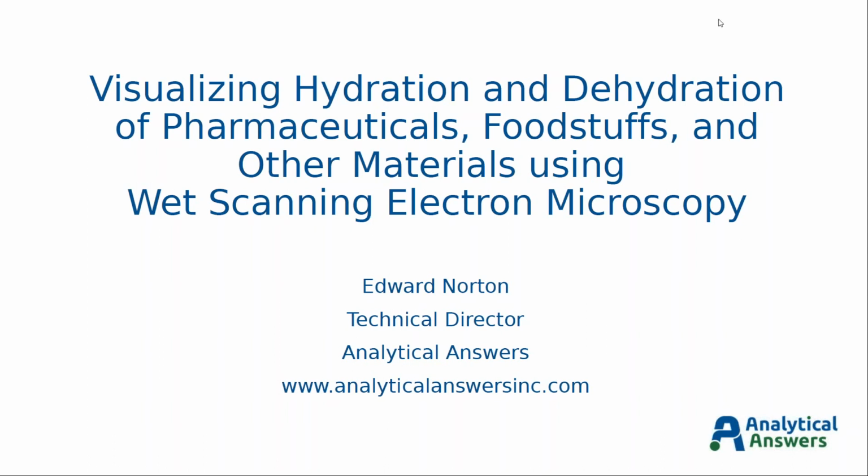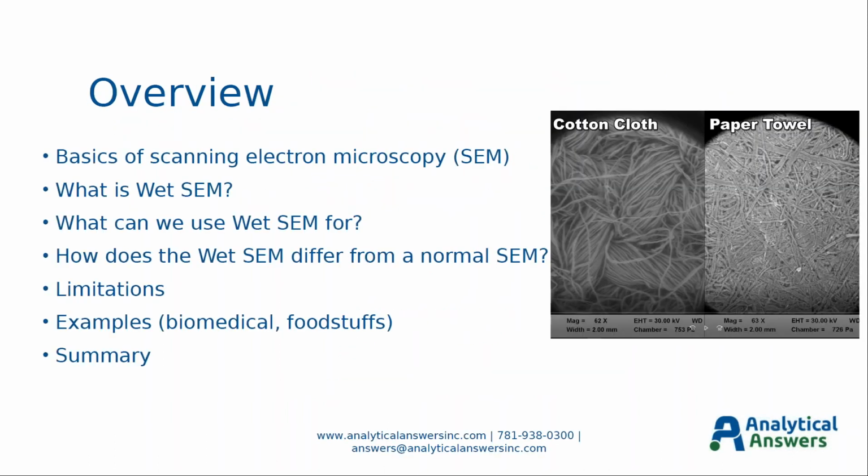Thank you very much. Of course, everyone can see the title here. We're going to be visualizing hydration and dehydration of various materials using wet scanning electron microscopy. And this is actually a very interesting field because it opens up a wide opportunity of experiments you can do in the scanning electron microscope that you just can't do any other way. So, without any further ado, let's move on to our presentation.